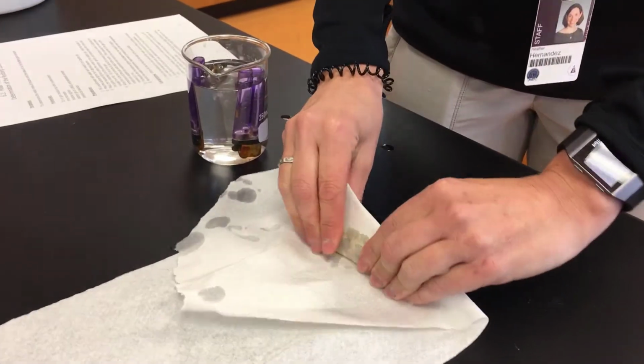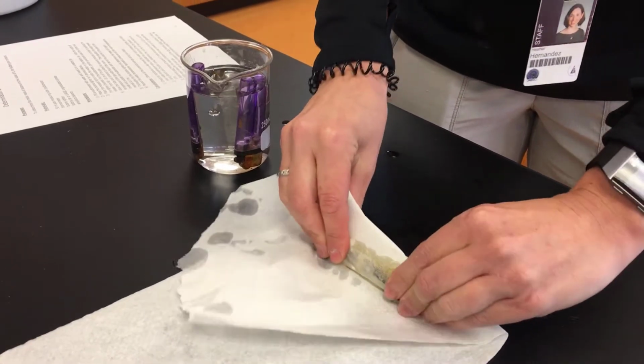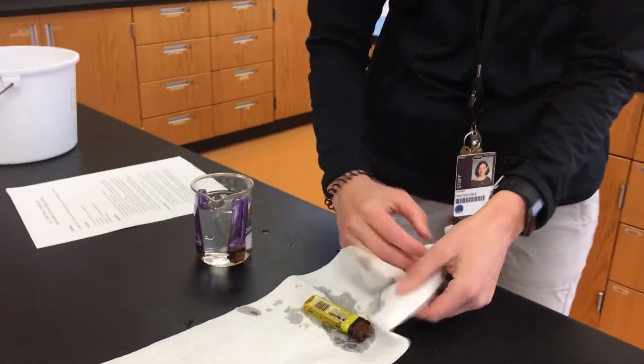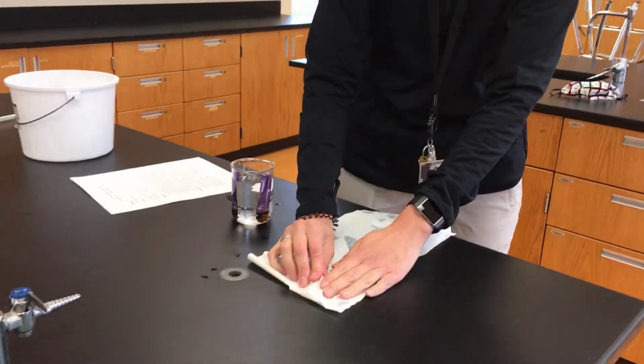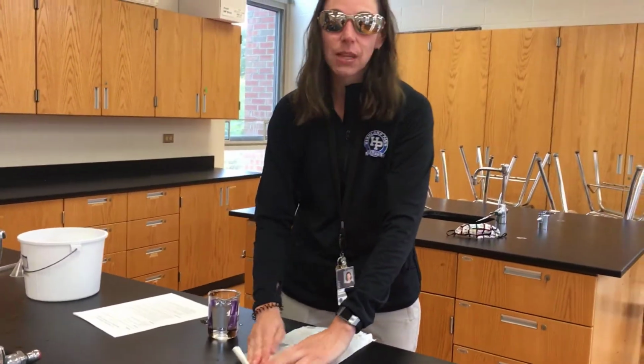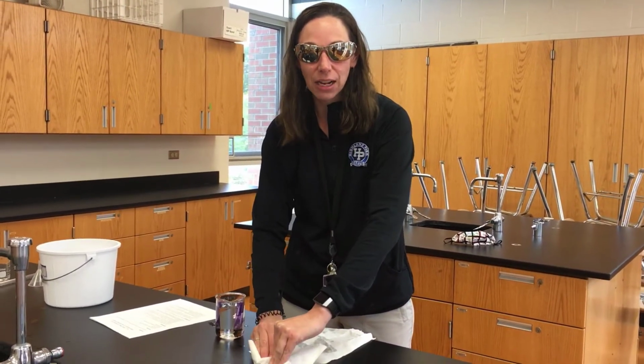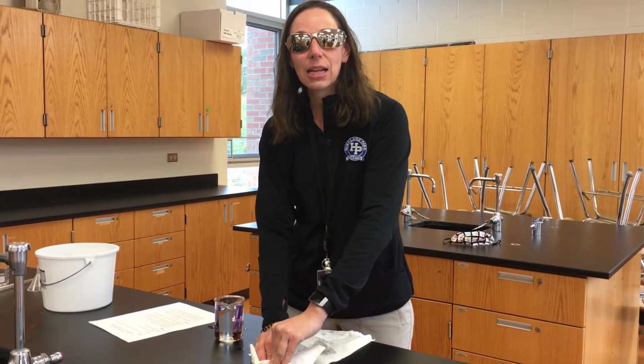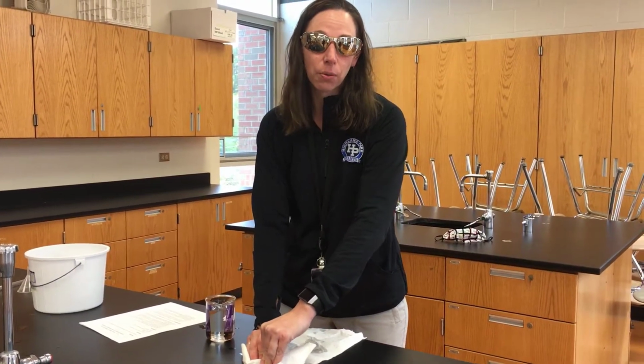But since we submerge it in water to collect the butane, the lighter itself absorbs water in some places that we can't really access. So we actually get a little bit better data if we soak it beforehand. So what we're going to end up collecting is the before and after mass of the lighter. We'll also collect the volume of the butane, and we'll give you the temperature and pressure of the room.